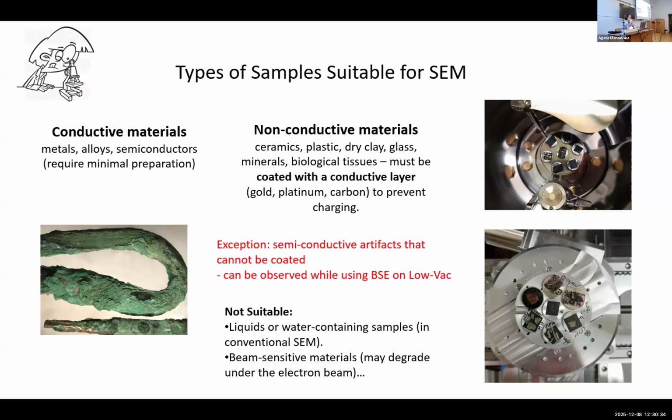What is not suitable are liquids or water-containing samples. Beam-sensitive materials may also degrade under the electron beam. So these are the basic information. In the case of the imprints on clay, we have those non-conductive materials, unfortunately. So I was trying to solve the problem of how we can prepare the samples, prepare the pottery, or get a proper image to investigate the microstructure.